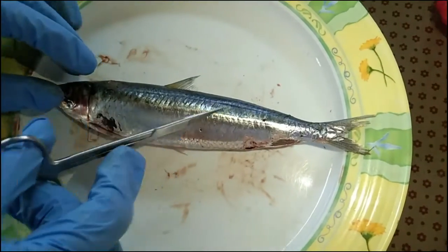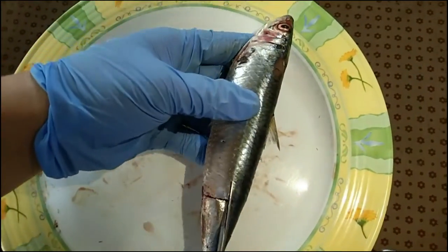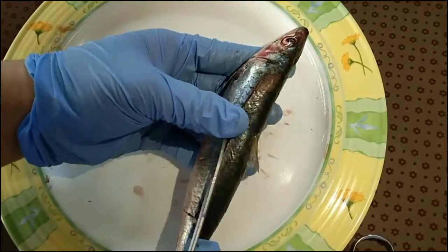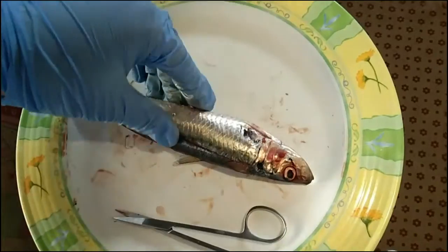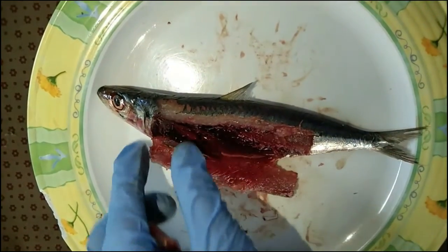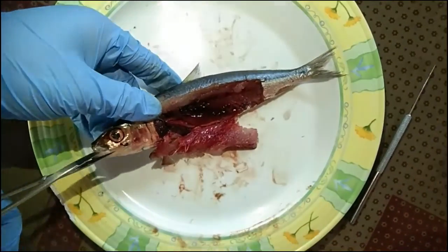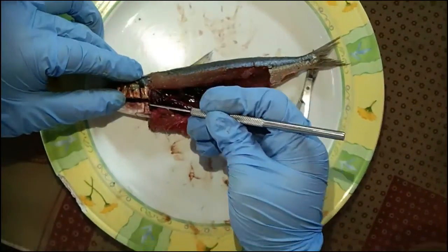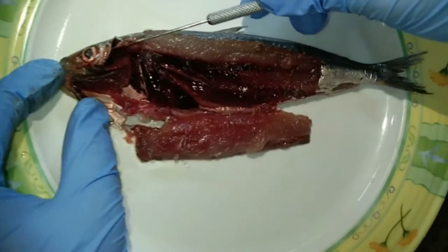Now, let us proceed to exposing the internal organs of the fish by locating the anus and, using scissors, cut upwards and to the left direction following the lateral side of the fish, then downwards. To expose the gills, cut the mouth of the fish in between the mandible and the maxilla. After exposing all of the internal organs, identify its parts.